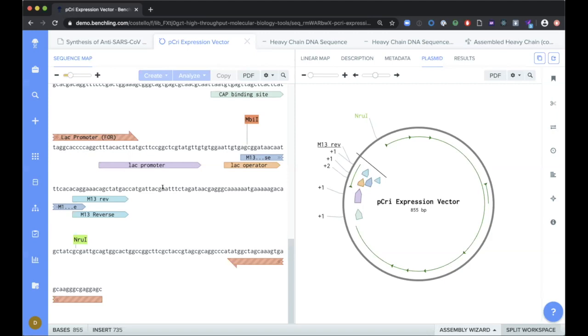Hey, Damien, just while we're waiting for that poll, I wanted to interrupt you with one of the questions we've had come through from Shuiwen Pan, which is, can you input sequence files in formats other than Vector NTI? Yes, you can. So Benchling supports a variety of different file formats. I don't currently have the list of them here. But anything ranging from an MA4 or PA4 archive file from Vector NTI to a multi-part FASTA, any GenBank files, any of the file formats that you might get from NCBI, etc., are accepted.